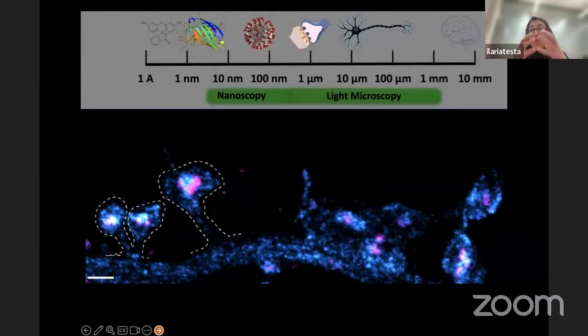But for you to know, there are two main different concepts in super resolution: the one based on single molecule detection, and the one based on what we call ensemble. The trick in one case is that you want to have always one single molecule per diffraction limited spot. So you trick your sample so that you have a sparse labeling, with photoactivation or so on.